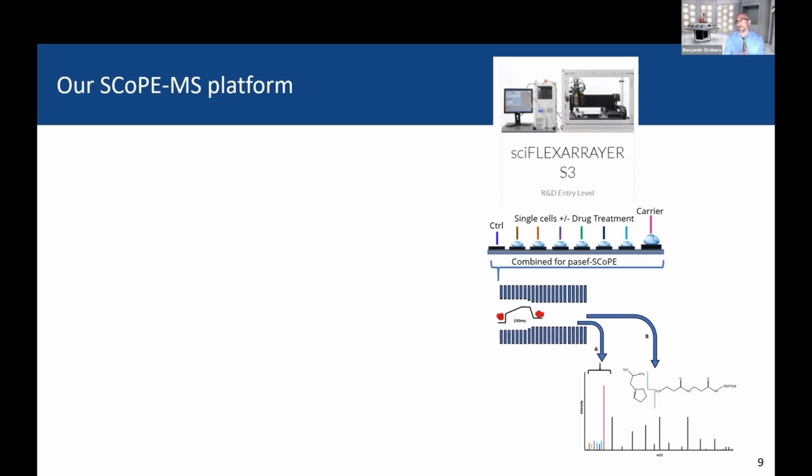And you don't have the cameras, you don't have the sorters, but that's what we have. So we sort across the street, 2,000 cells sorted out in a plate, sends them back, $120. Bring them across in a dry ice device, and we do all the prep there. So in general, let's look at how we set up the prep first.